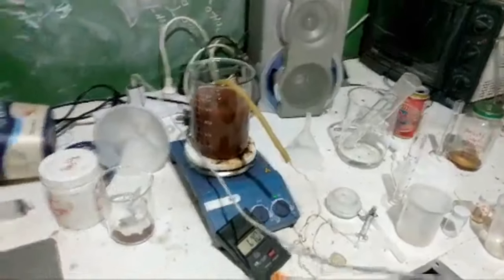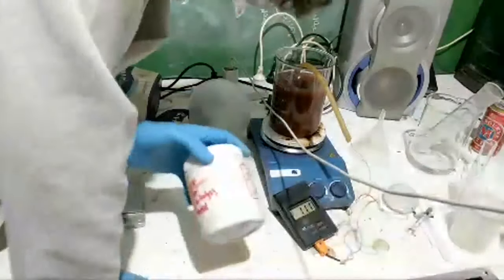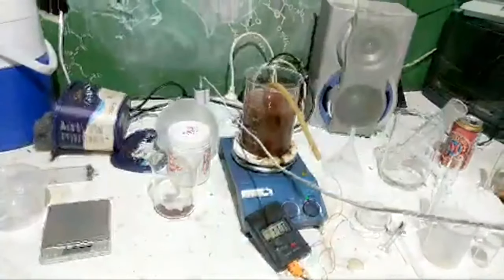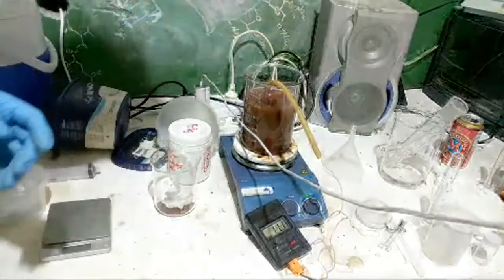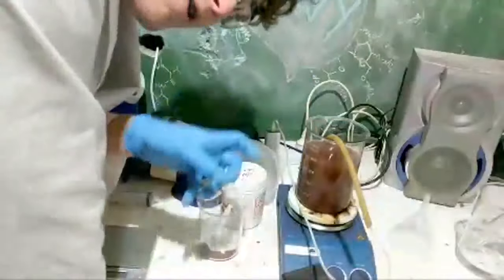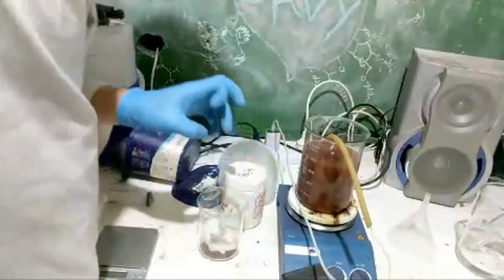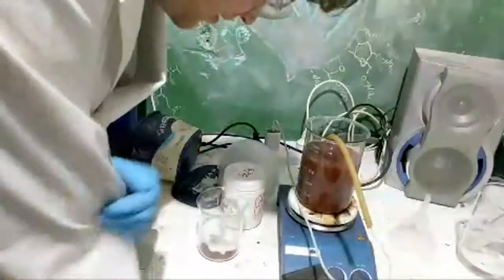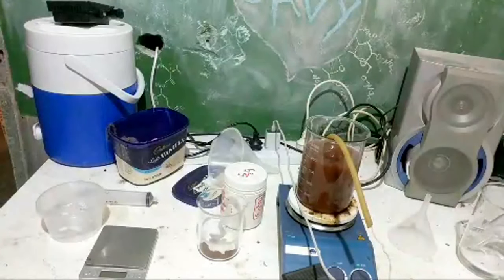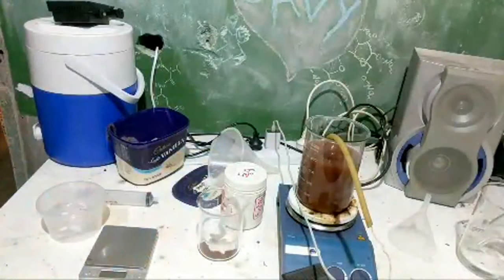This is a slight side point, but there's a chance it might be yellow, and that's because this was made from steel, and I don't know how much chromium is in the steel. I don't think there's going to be that much chromium, but if there is, the bleach should easily oxidize it to chromate, and then when we add barium later on, we'll precipitate out barium chromate, which is a bright yellow. So there is a small chance that our end product, instead of being a nice pink or purple, will be bright yellow, which would be a real shame, another yellow chemistry all the time. Normal steel shouldn't have much, so hopefully it should be okay. That's what I'm relying on.